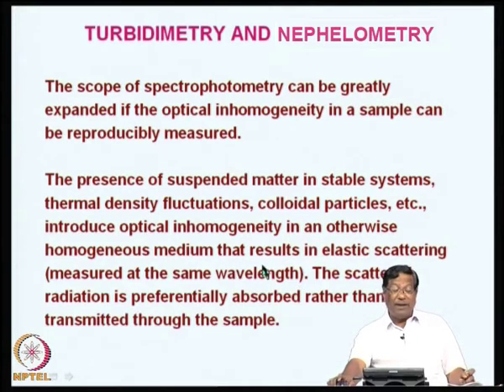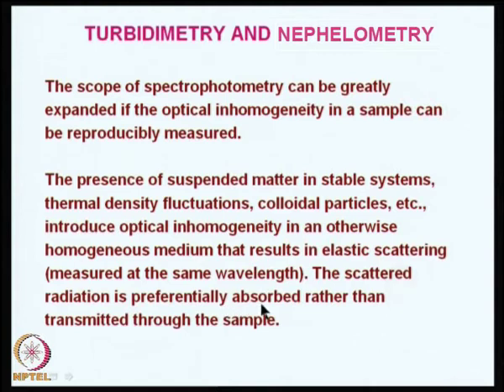That results in scattering, some elastic, some inelastic. Elastic scattering measures the absorbance at the same wavelength. Inelastic would give you absorbance at some other wavelength. So, the scattered radiation is preferentially absorbed rather than transmitted through the sample. This is the basis of spectrophotometry.